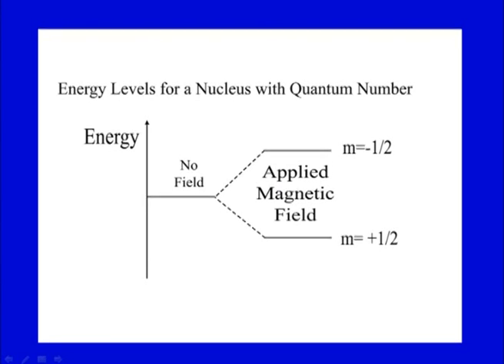If the number of neutrons and the number of protons are both odd, then the nucleus has an integer spin, that is 1, 2, 3 and so on. Those atoms which have spin plus half or minus half can be utilized in the NMR technique. In the figure here, we can take the example of a proton.